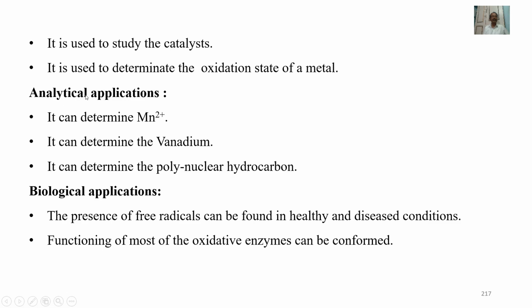Analytic applications. It can determine Mn2+ ions. It can determine vanadium. It can determine polynuclear hydrocarbons. Biological applications. The presence of free radicals can be found in healthy and diseased conditions. Functioning of most of the oxidative enzymes can be confirmed.